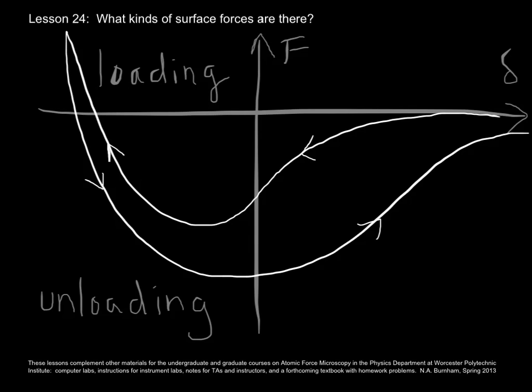I'd like to talk about surface forces in this lesson, and I've sketched here a force separation curve taken with a stiff cantilever that for the first time is different loading and unloading. And they differ because, in fact, the surfaces have come into contact.